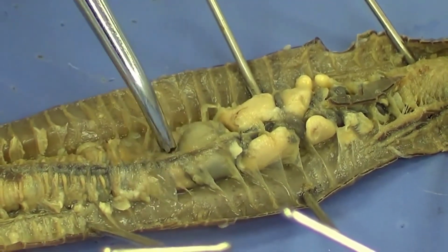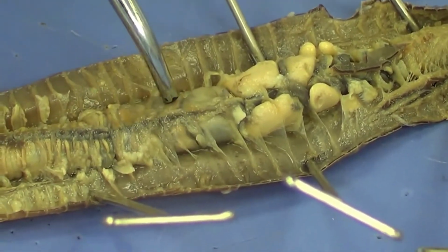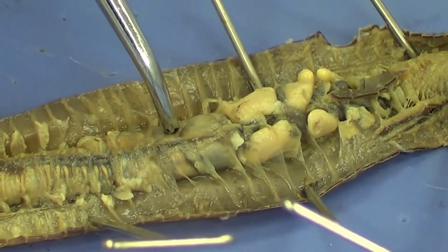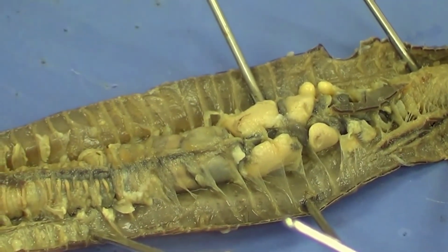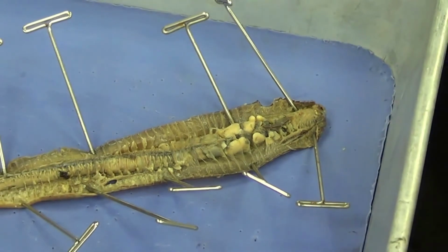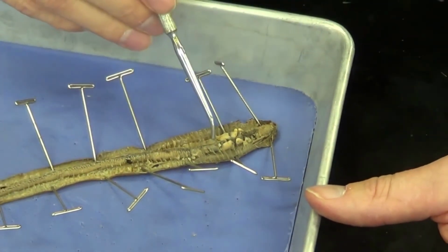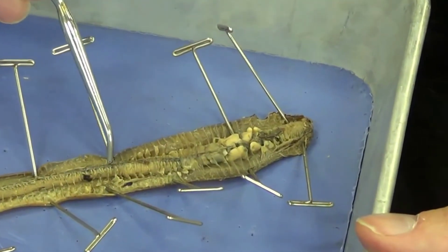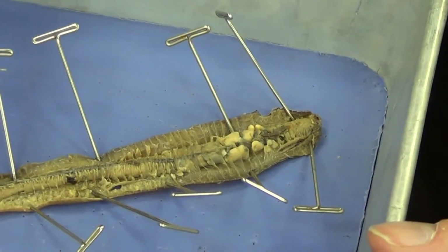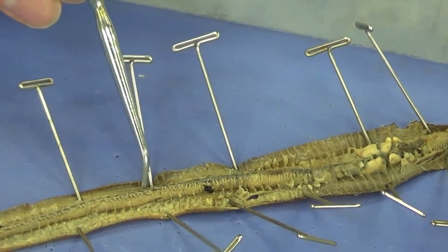And then you have this structure right here. Notice how firm this is. Very muscular, very firm. This is going to be our gizzard, where the food gets ground up. From there, we're going to go into the long intestine. And again, we have this long intestine to create lots of surface area. Traveling along the top of the intestine is our dorsal blood vessel. You can see that dark structure right there along the dorsal part of the worm.